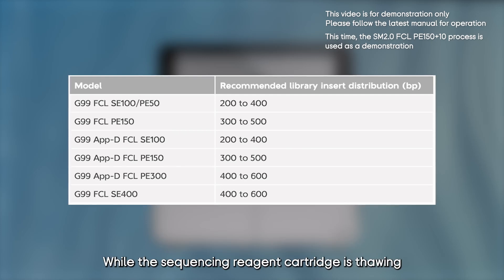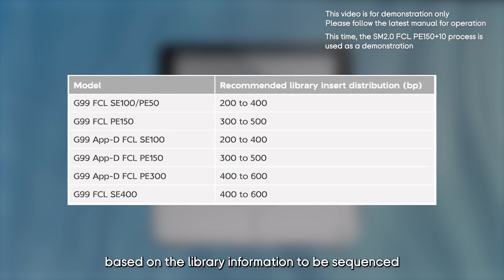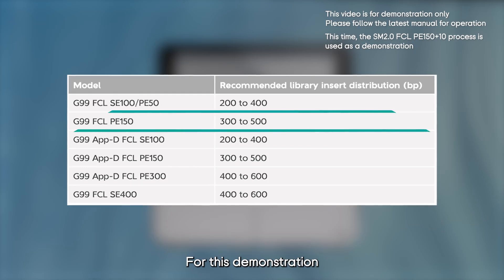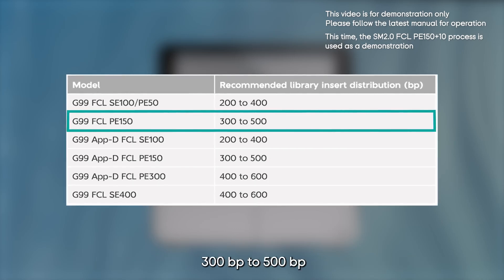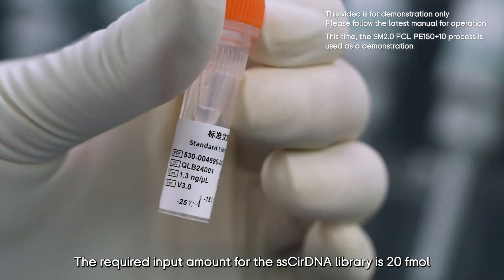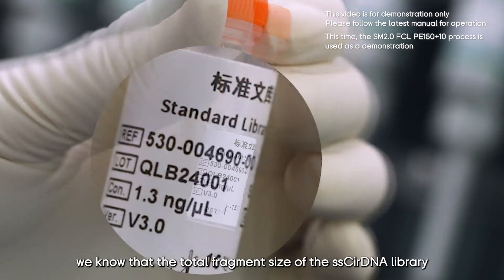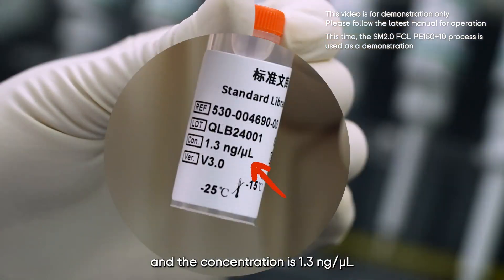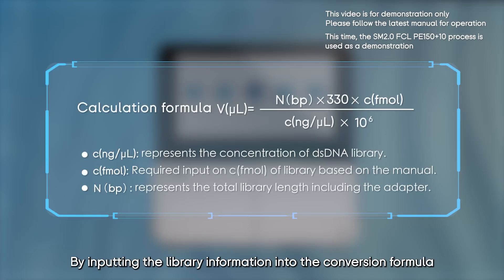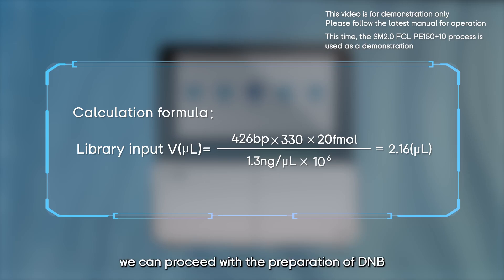The time required for water bath thawing varies for different sequencing reagent cartridges, so choose the appropriate method based on your needs. While the cartridge is thawing, calculate the input volume of the SS circular DNA library. For this demonstration using the G99 FCL PE150 kit, compatible with libraries of insert sizes 300–500 base pairs, the required input amount is 20 femtomole. The total fragment size is 426 base pairs and the concentration is 1.3 nanogram per microliter. Using the femtomole-to-nanogram conversion formula, we calculate that 2.16 microliter of library is needed.